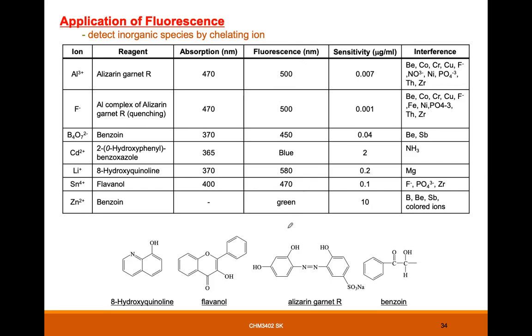So what's important is sometimes, how do you know which wavelength to use? For standard reagents, for a standard compound, you can get the excitation wavelength from the literature. But let's say you synthesize a new fluorescent compound. Then of course you have to do trial and error.